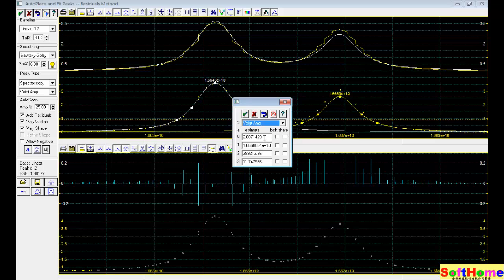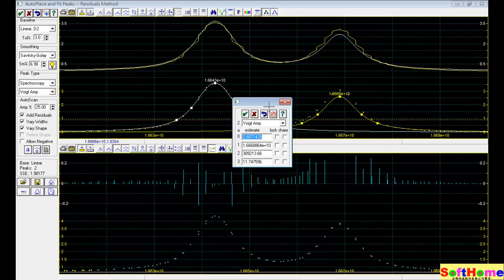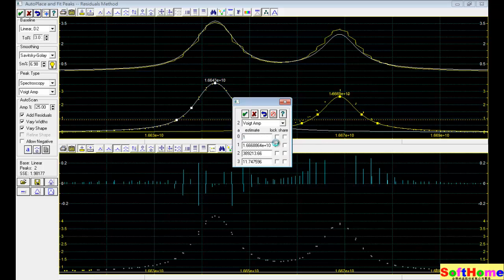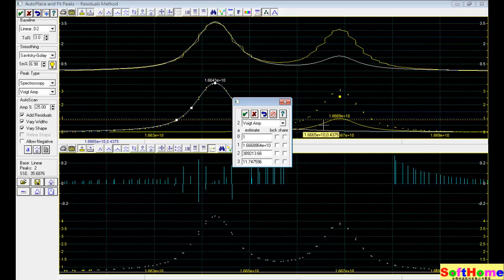We can see the parameter. You can change the parameter directly. Now it's 2.6. We change it, just for sure. We change it to 1. So you can see the amplitude become 1.